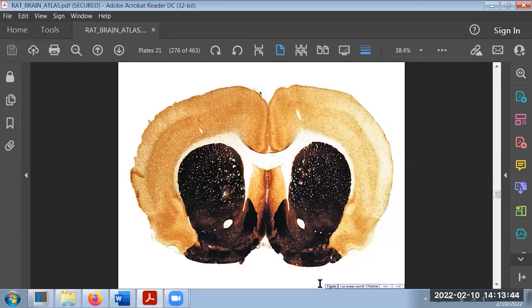Yes? Just to clarify, the Bregma coordinate that they give us is negative when we report the coordinate. The Bregma coordinate, so if the AP, the anterior posterior location, is behind Bregma, it's negative. Okay. And if it's in front of Bregma, it's positive. It has to have a positive or negative sign though to make it clear. That makes sense. And it's just reflected in what it's given. Yeah, so if we're looking at these coronal pages, it'll just give us it, and if it doesn't have a negative sign, then it's plus. Awesome. Yes. That makes sense.